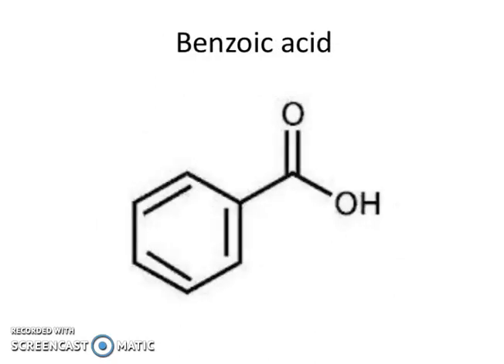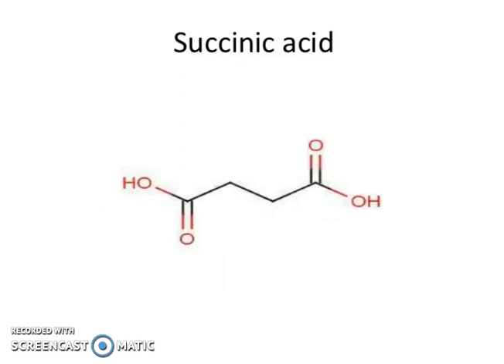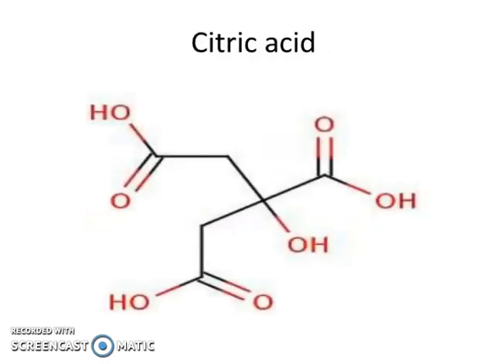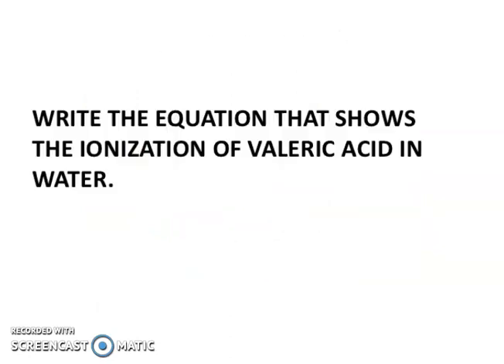This is the structure of benzoic acid. This is the structure of oxalic acid. This is the structure of succinic acid. This is the structure of lactic acid. This is the structure of propionic acid. This is the structure of citric acid. This is the structure of propionic acid.